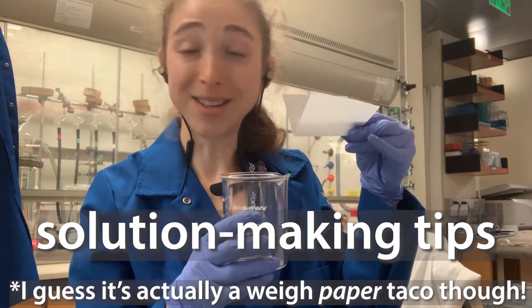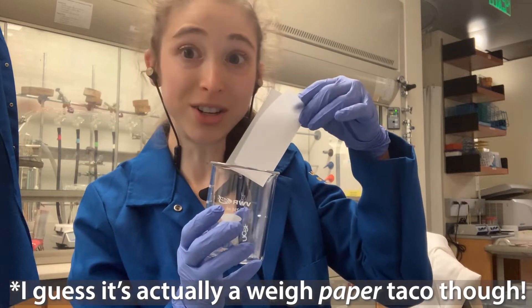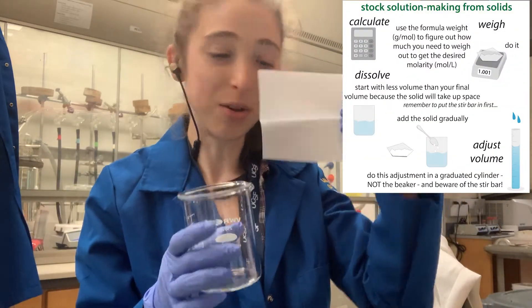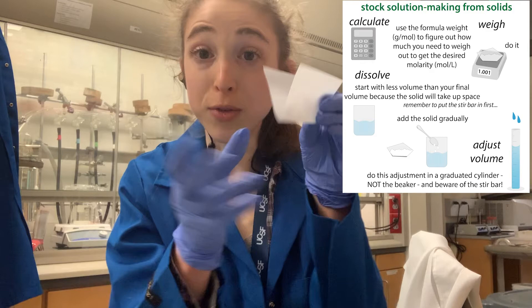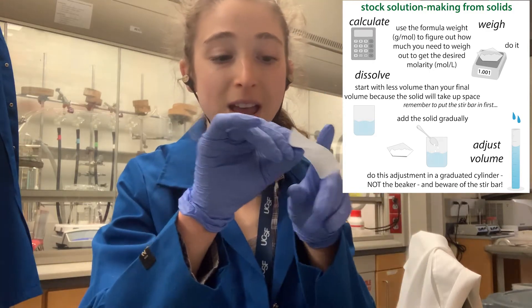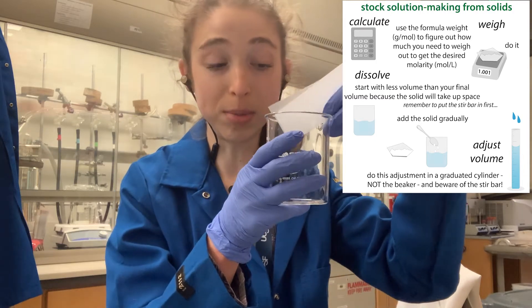I found that the weigh boat taco is a good way to go when you are making solutions. Basically a weigh boat taco, as I like to call it, is where you take weigh paper and when you're weighing out a solid, you fold it in half first. Now you can weigh on it and then directly transfer it into a beaker with liquid.